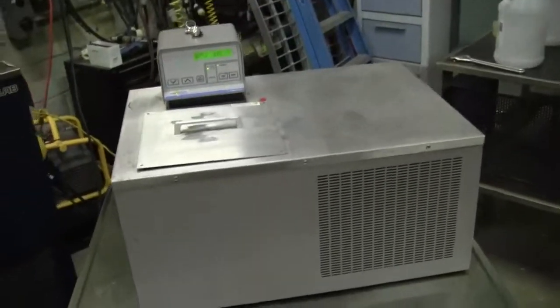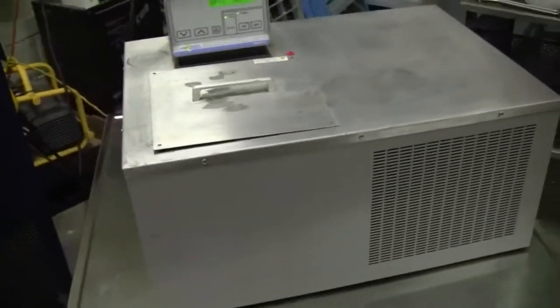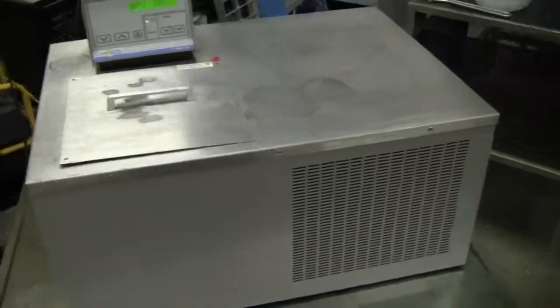Hi, this is Michael Naitow from Hi-Tech Fitter. Today we're looking at a VWR Scientific Recirculating Bath Chiller. It's about 27 inches by 19 by 13 inches high.